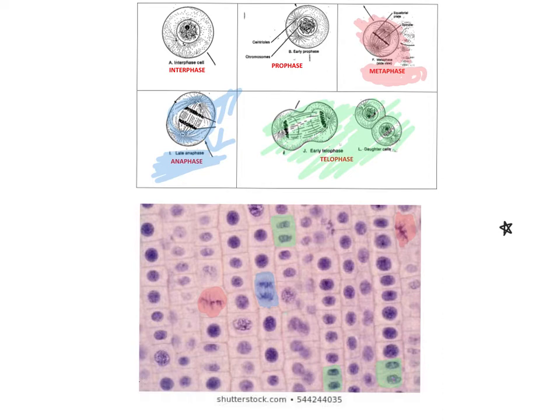These are a little weird here. I think the picture's overlapping, like there are multiple cells there, but I'm going to color those too because I feel like I can see two blobs inside of them. Maybe this one too.